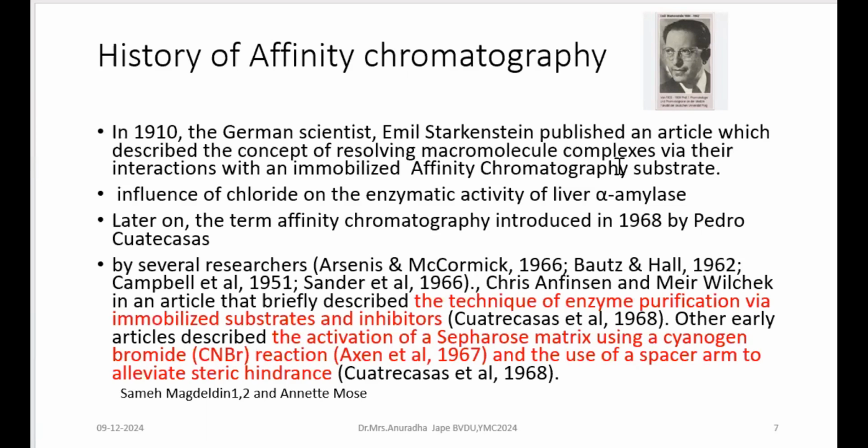Of course, this concept was first applied to biological samples, that was alpha amylase from the liver, and it was purified.